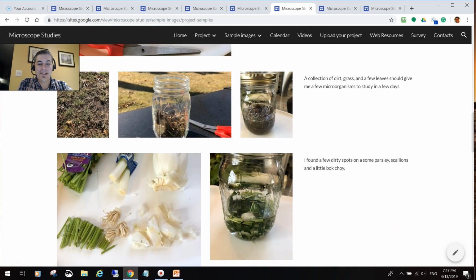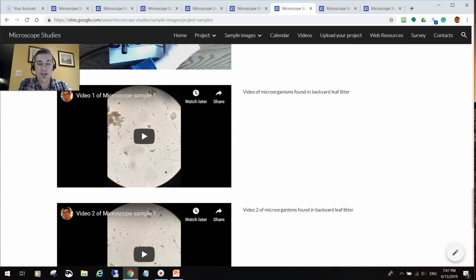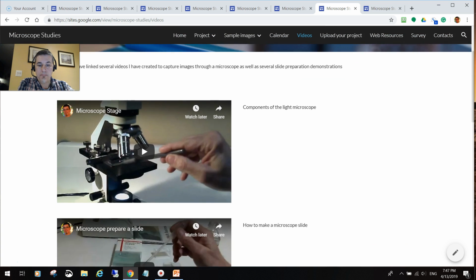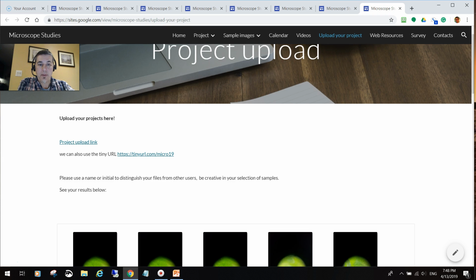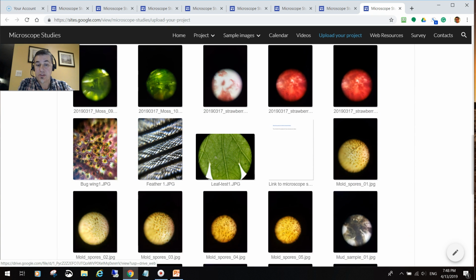We did some other projects collecting microorganisms, so using vegetable matter from either the backyard or from the kitchen, and I videoed for the students what the stuff actually looked like that grew in a jar of water over a period of a week from dirt and leaves that were collected in the backyard. More videos, again, are a little description of how the brine shrimp experiment went and some videos of the brine shrimp swimming around.